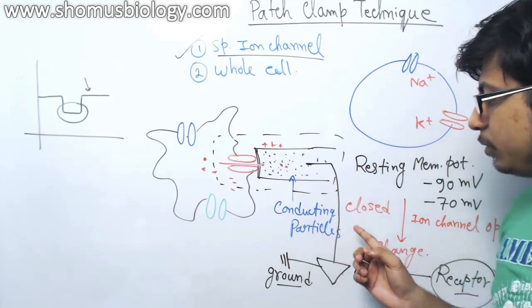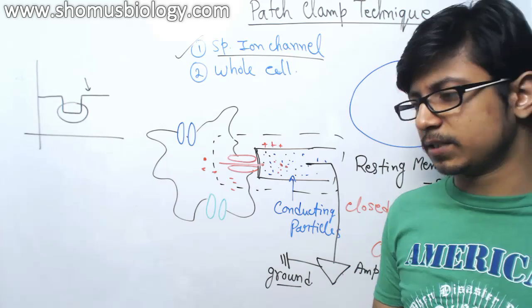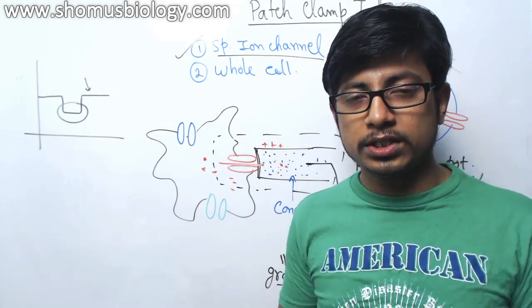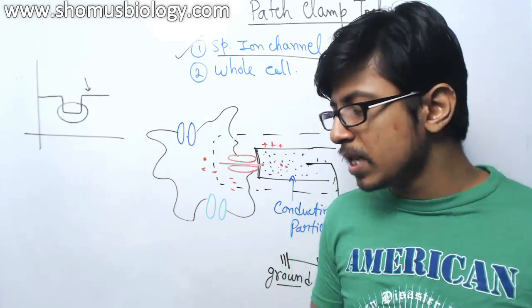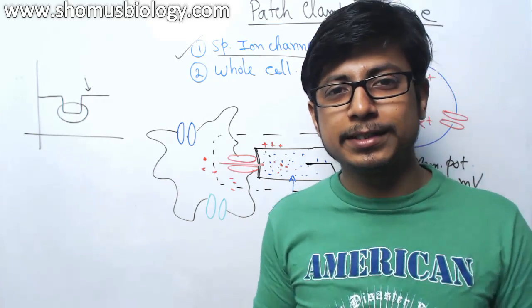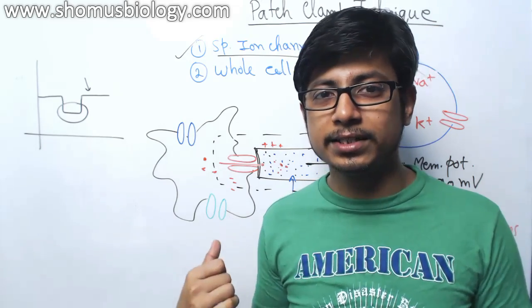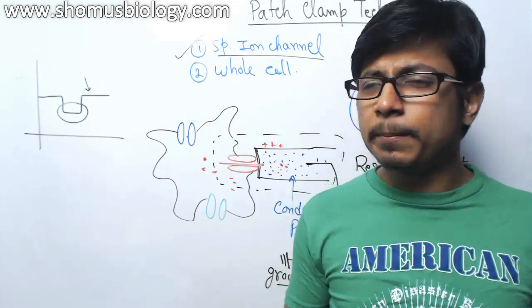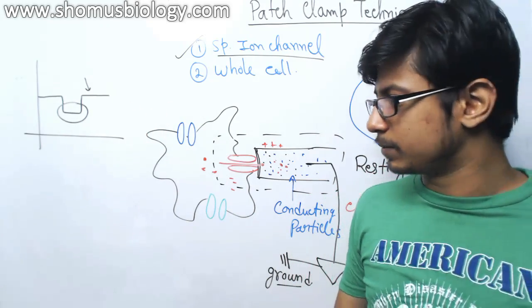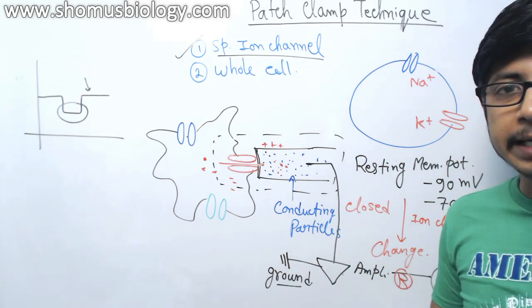And the electrodes that we normally use for this process are also very expensive, so this whole experiment is a little expensive. The electrodes used are silver and silver chloride electrodes. So it's a very expensive experiment. This requires proper professional skills to handle, but the data analysis is not that difficult for them. It's quite easy compared to the other parts, but you also need good software to manage and tag it with all these facilities.